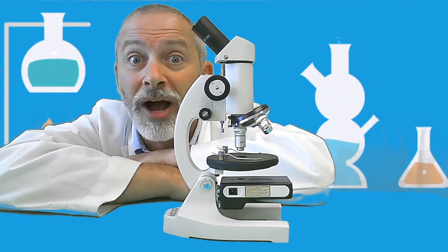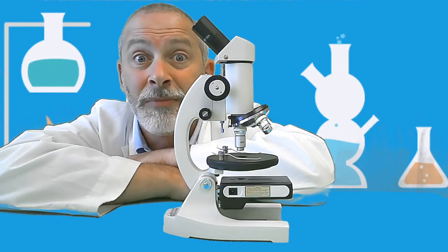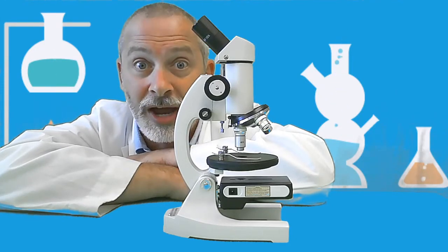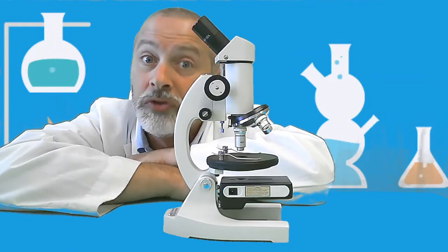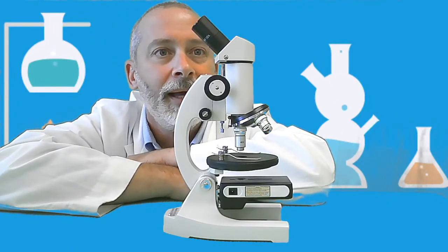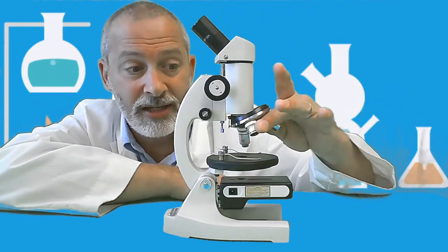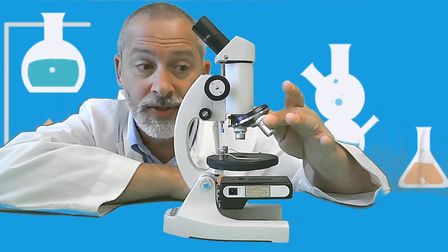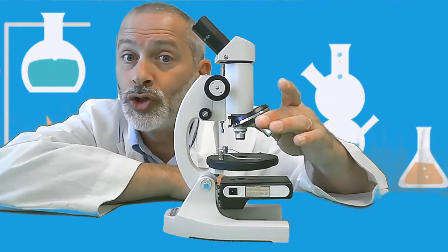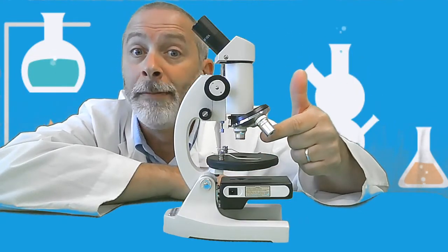That makes your jaw drop when you think about it. 400 times magnification would make you 2,000 feet tall. A lot of numbers here, right? Remember, eyepiece, always 10. Objective lens, it changes. And you are the one who changes it, and you've got to click it into position. So we'll get back to this. So these are the objective lenses.